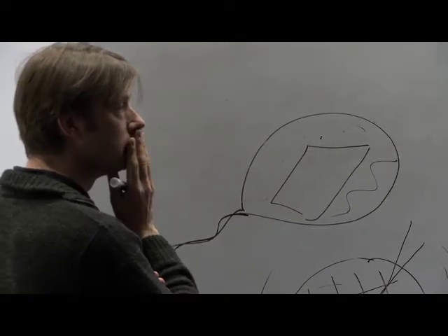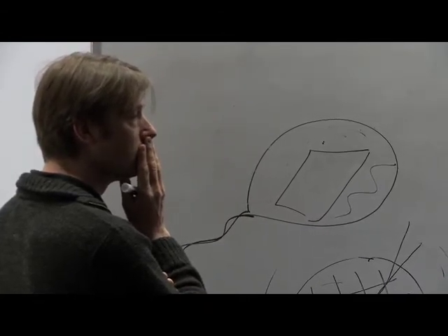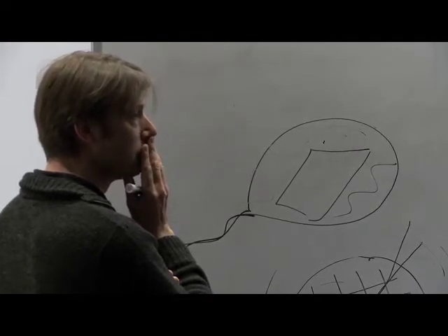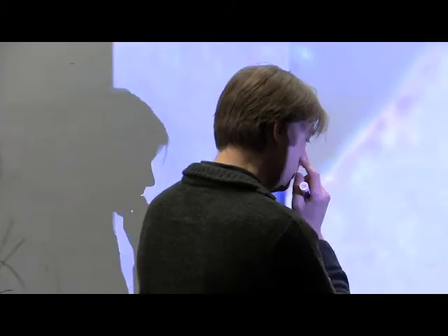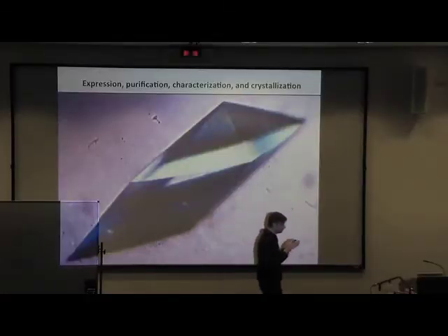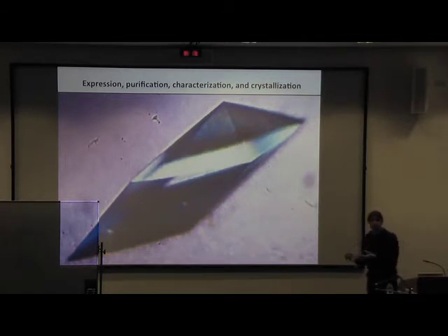So actually the difficulty in finding a cryo buffer is that you need to find a condition where both the crystal and the liquid surrounding it have as little differential in volume change as possible. On that note, we have X-ray machines downstairs, and they're being used less and less frequently because everybody goes to the synchrotron. But they're actually great for testing cryo conditions. It's a bit of work, but it's definitely worthwhile.